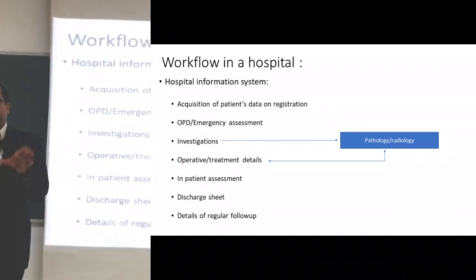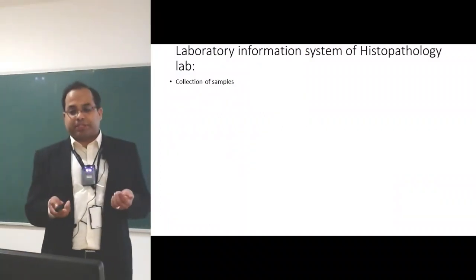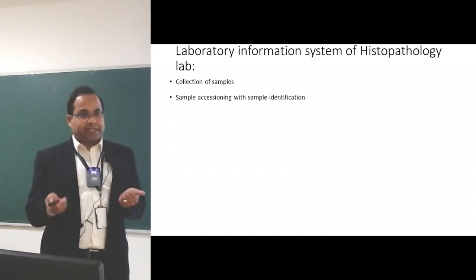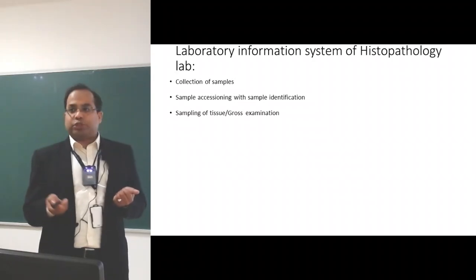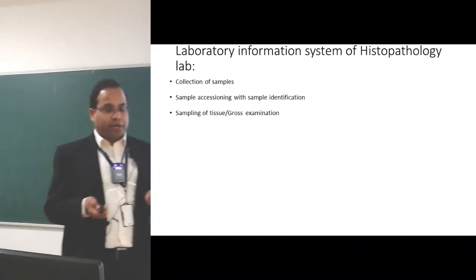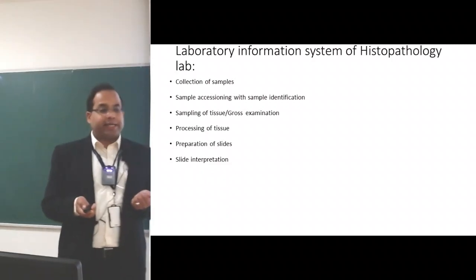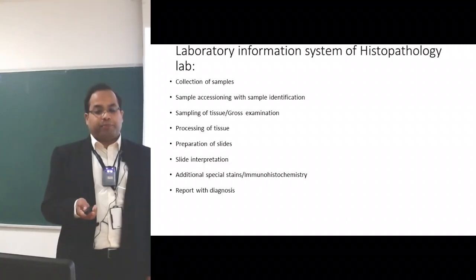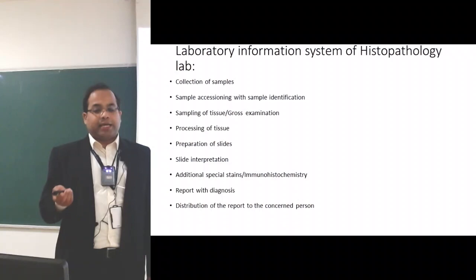So this is completely different from a workflow of a laboratory information system or a histopathology lab. It starts with collection of samples, followed by sample accessioning and sample identification, sampling of tissue or gross examination. I will come to each one of them one by one. Processing of tissue, preparation of slides, slide interpretation, additional special stains or immunohistochemistry, report with the diagnosis, distribution of report to the concerned person, and then discarding of the tissue.